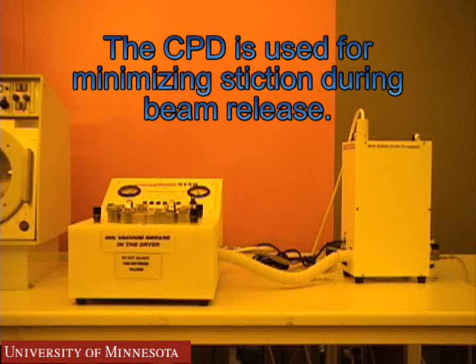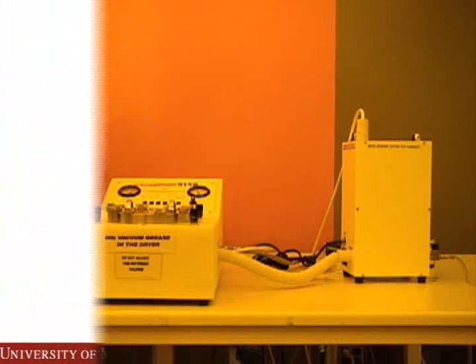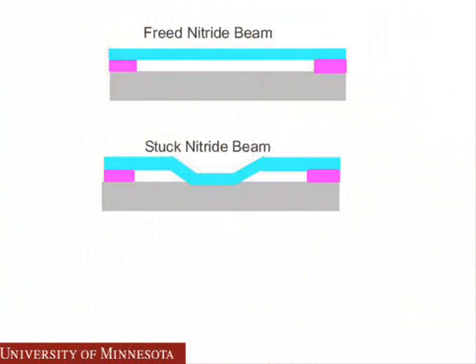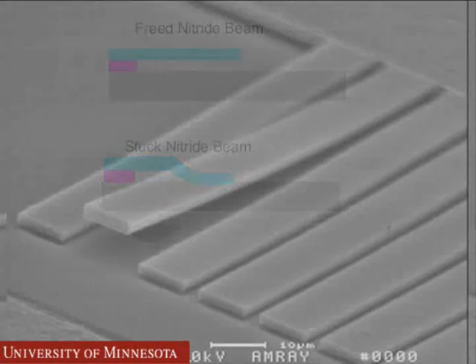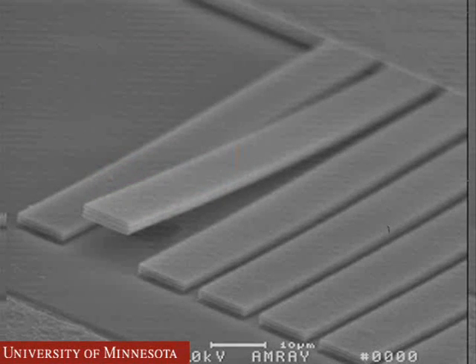The Critical Point Dryer, or CPD, is used in MEMS processing. During the beam release step, the CPD can be used to minimize stiction. Stiction is what happens when beams become stuck to the substrate. This occurs during the beam release step. Beams are attracted to the substrate by capillary forces, causing them to bend down and become stuck to the substrate. This is an example of some stuck and unstuck polybeams.